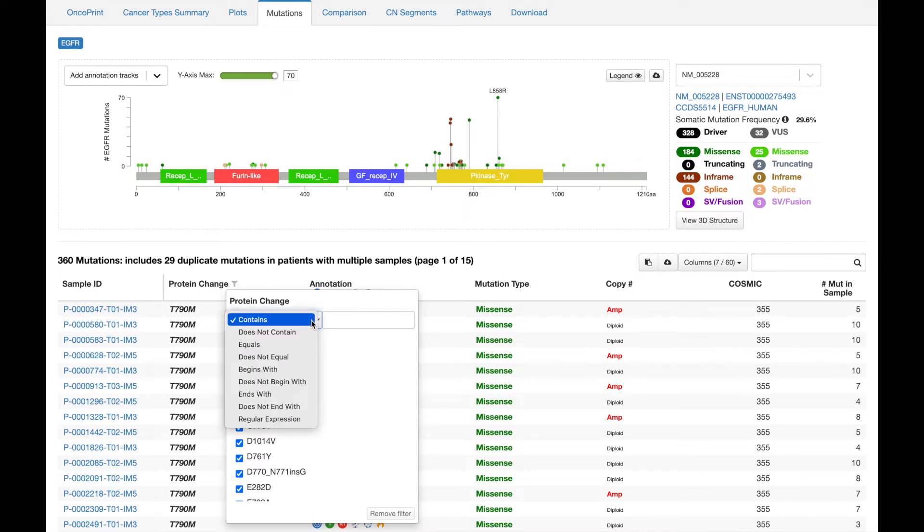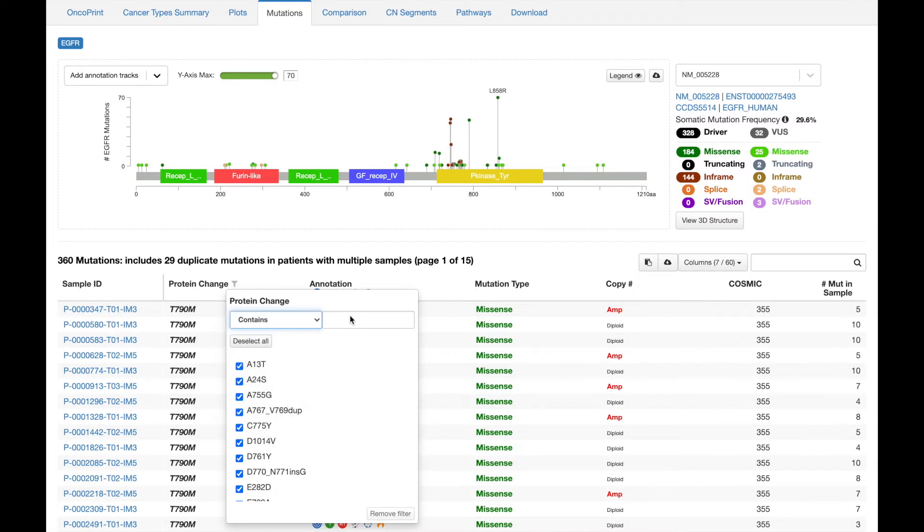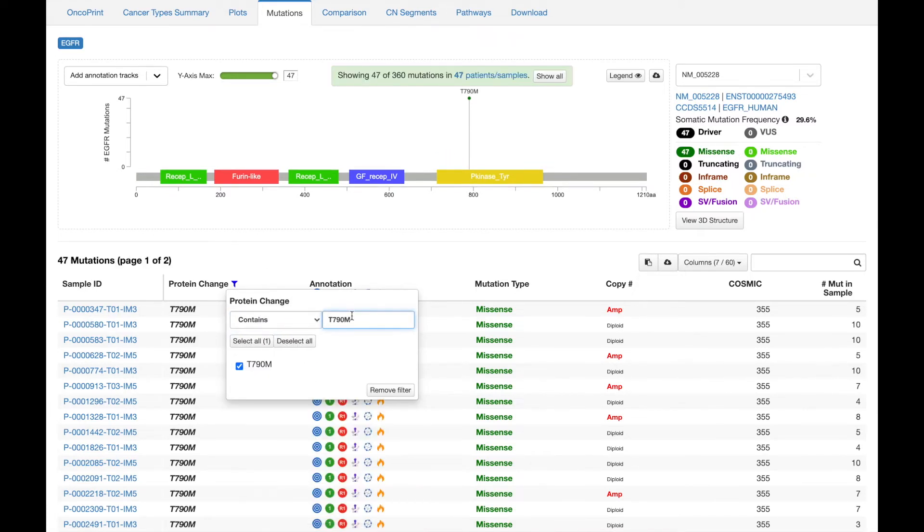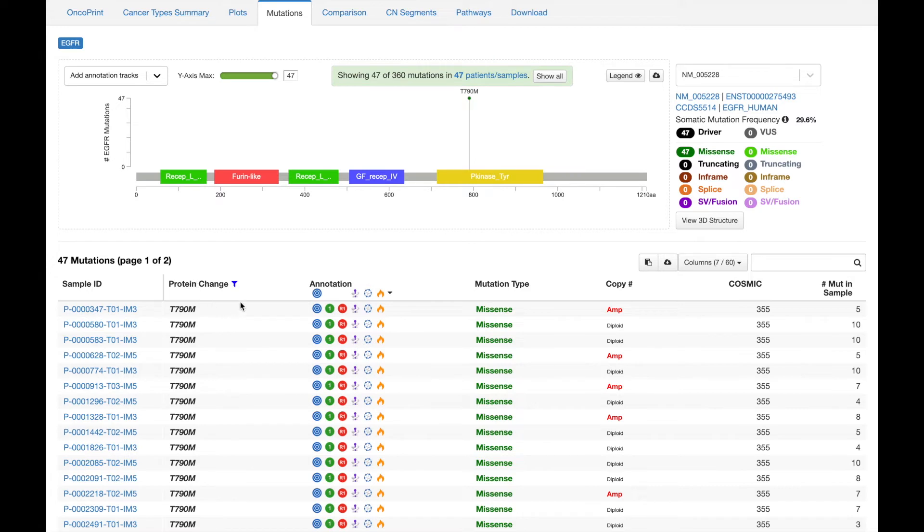You can see that we provide a number of ways to define your filter, but I'm going to stick with the default and filter to just the T790M mutations. Notice that the filter icon is now blue to indicate that a filter has been applied to this column.